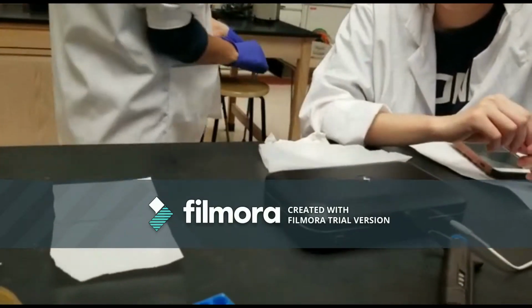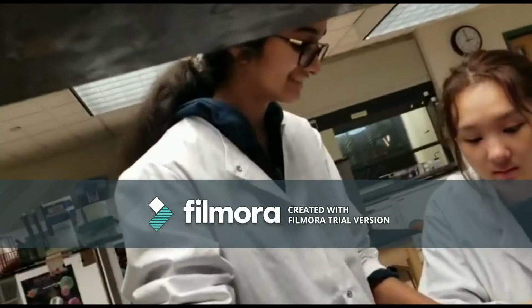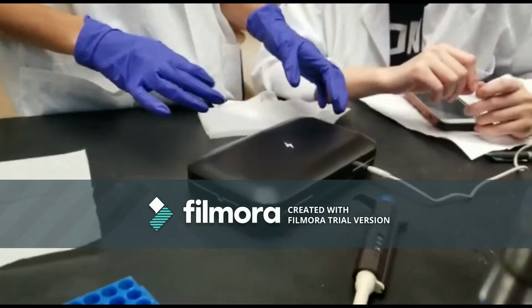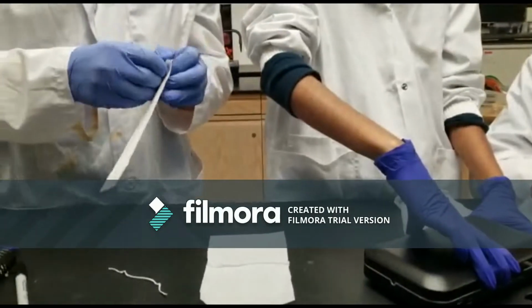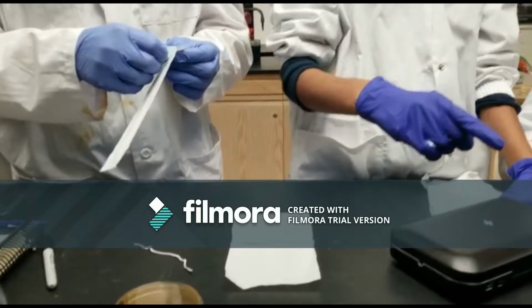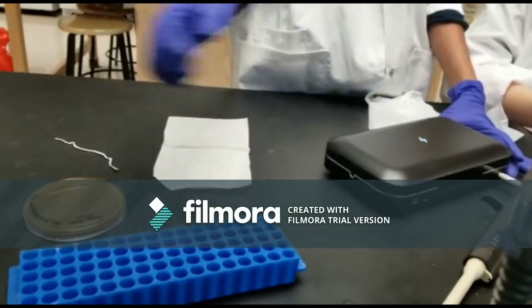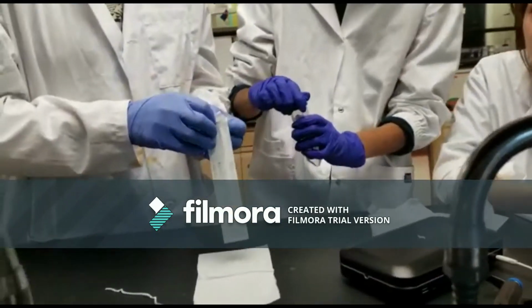The light on the PhoneSoap device dimmed and eventually turned off, indicating that the sterilization process was over. A new sterile swab was obtained, and the second half of the cell phone was swabbed following the same method that was used earlier in the experiment.